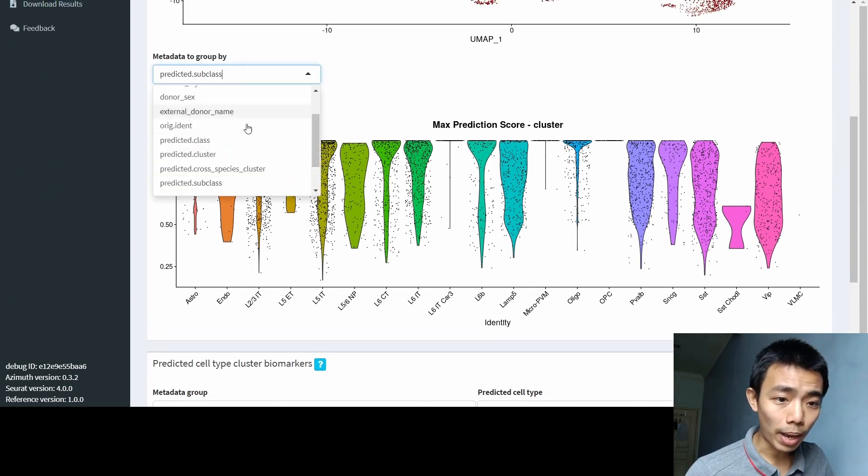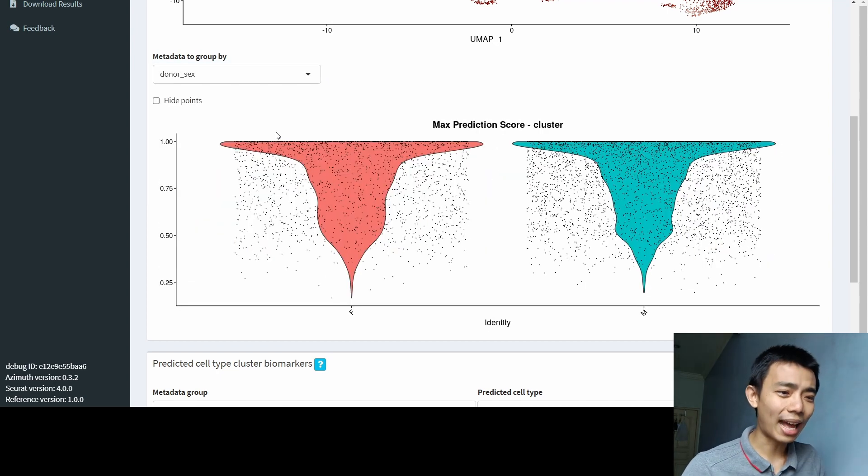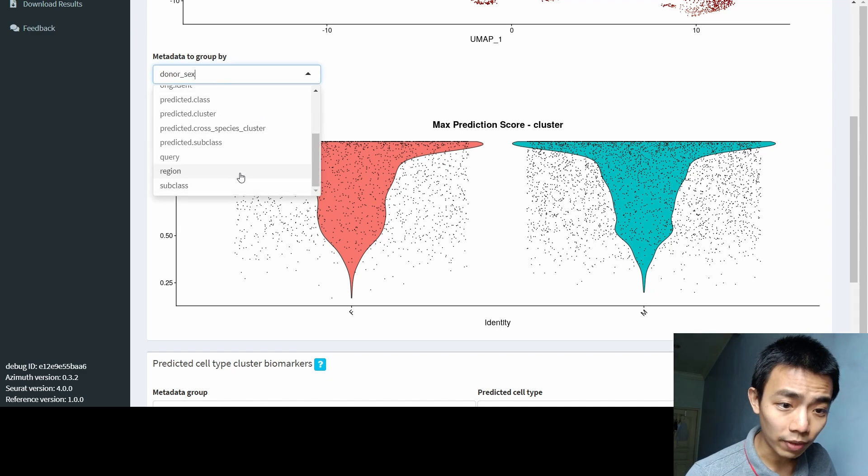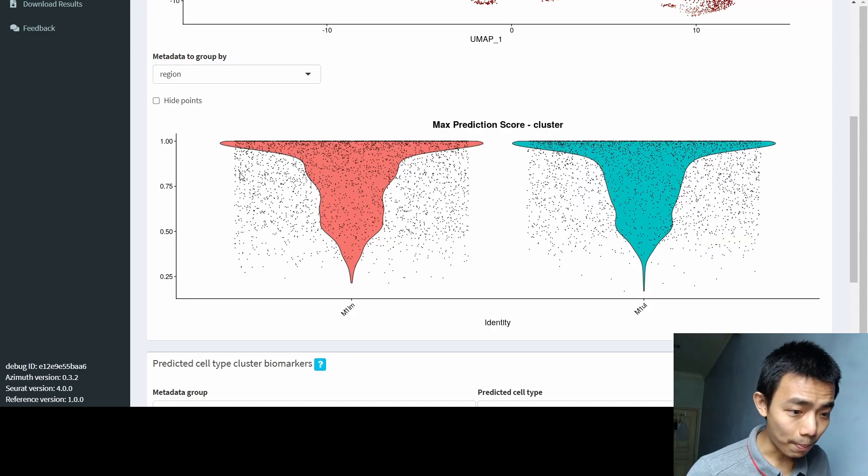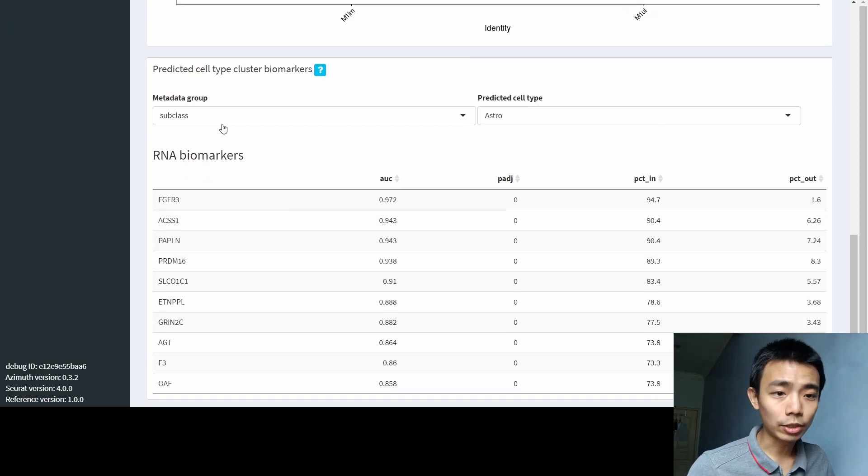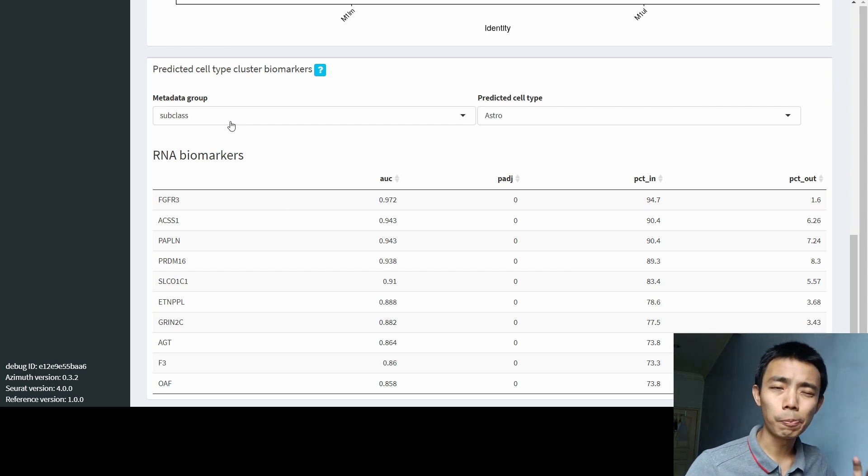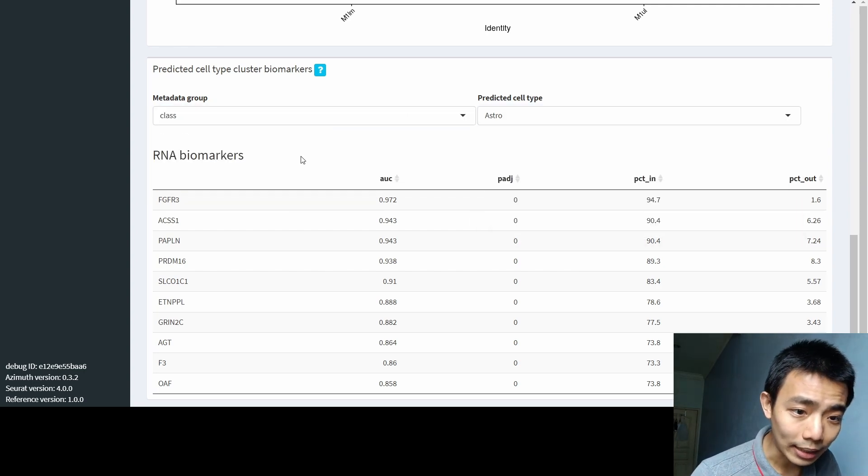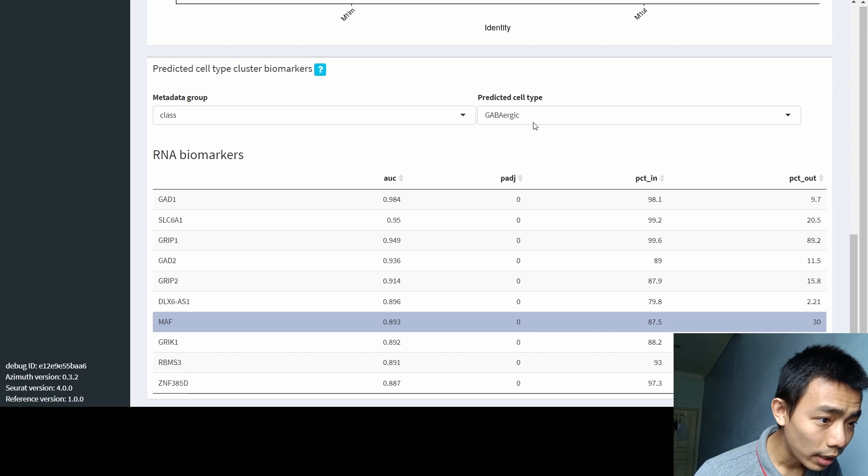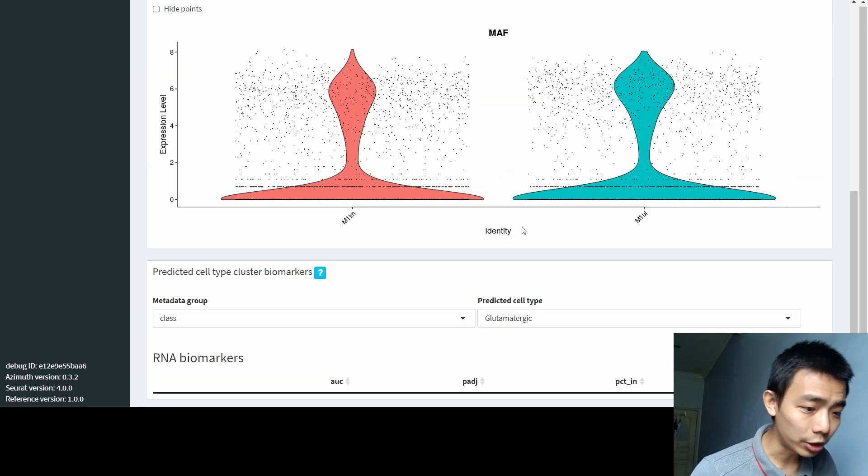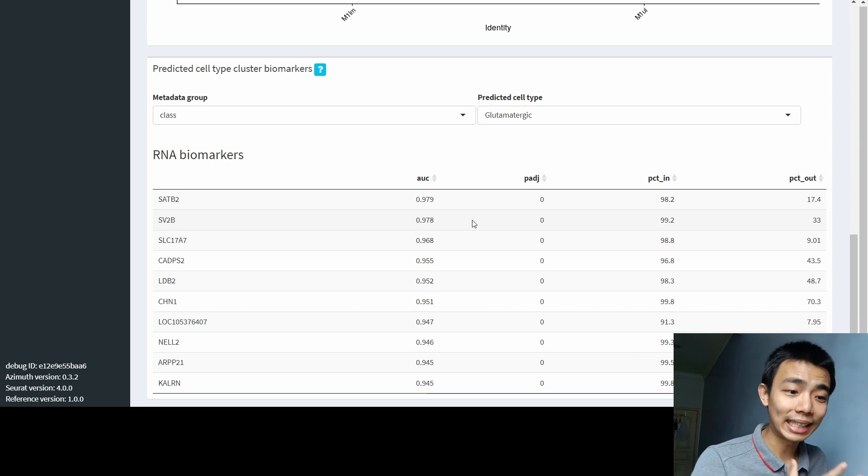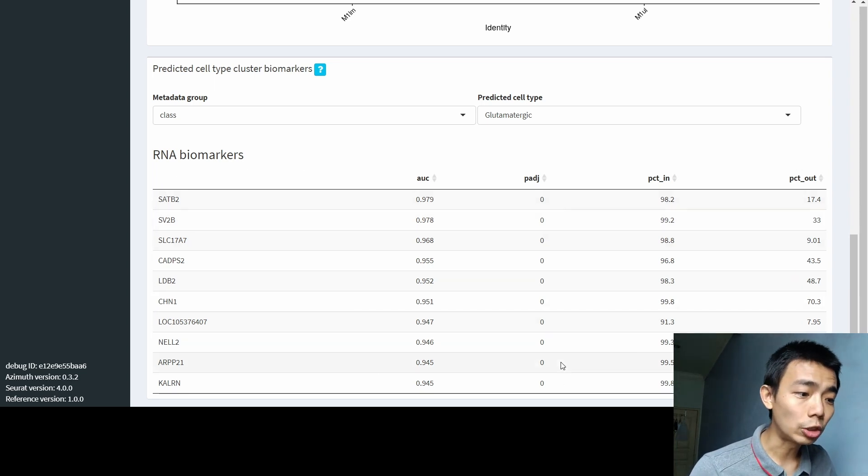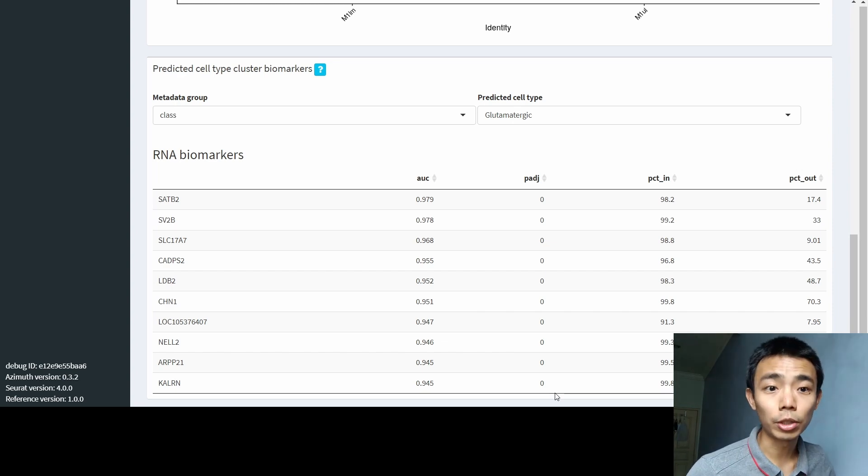And you can actually have like a predicted cell type cluster marker. So these are actually the differential gene expression that I talked about before. For example, I want to look at the classes of glutamatergic. So what are the cell markers that can identify this class? And you can actually see these are the RNA biomarkers and they are the p-values and they are confidence level and so on and so forth.